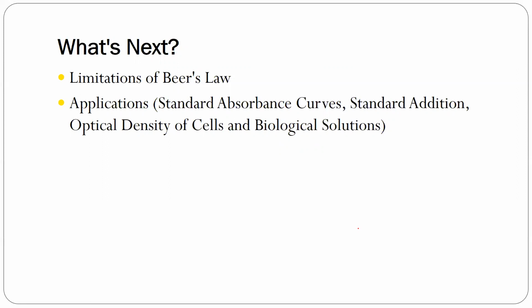Diba you have a certain measured value, let's say potential, or maybe pH versus yung concentration. Tama ba? So ganoon din yung gagawin natin with absorbance. But there will be another method to analyze your samples, okay, using the standard addition method. And we will look for and discuss applications in biological systems, such as determination of optical density of cells and other biological solutions.